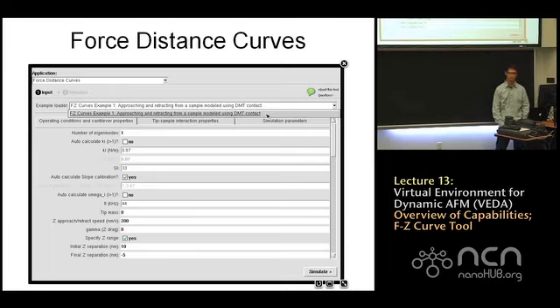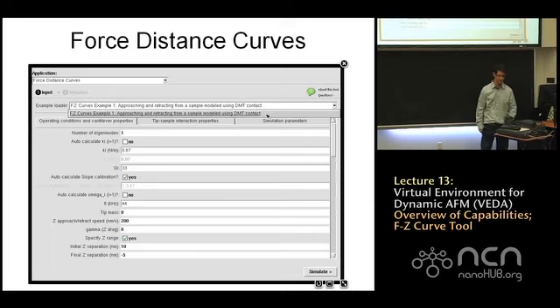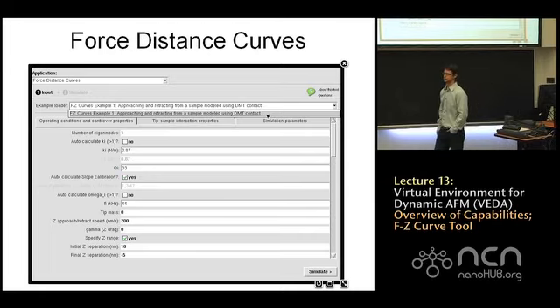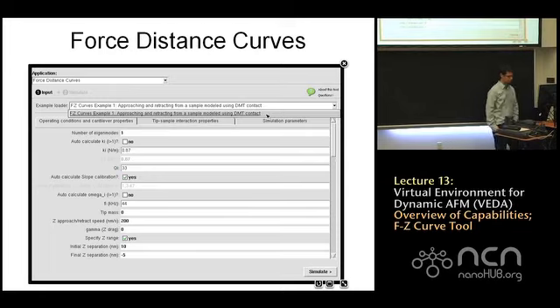Okay. And from there, you'll notice immediately below that is something called the example loader. This allows us, since we've done some examples in the manual, to load all the inputs instantly if you select the example loader. There's only one example for force distance curves, so let's pick example 1, approaching and retracting from the sample, from the drop-down menu. Okay?